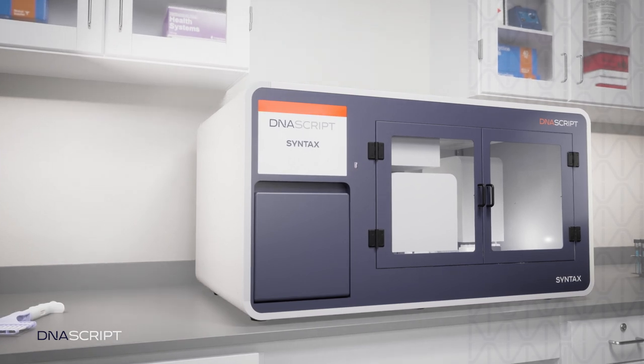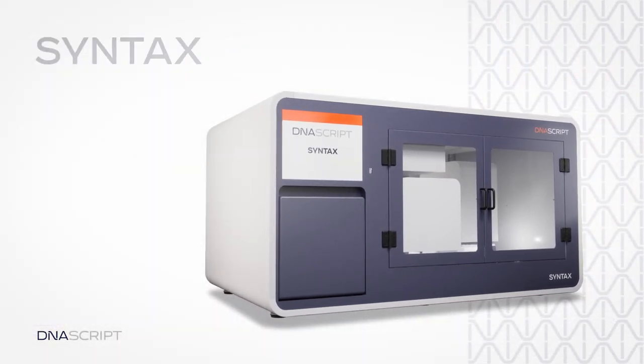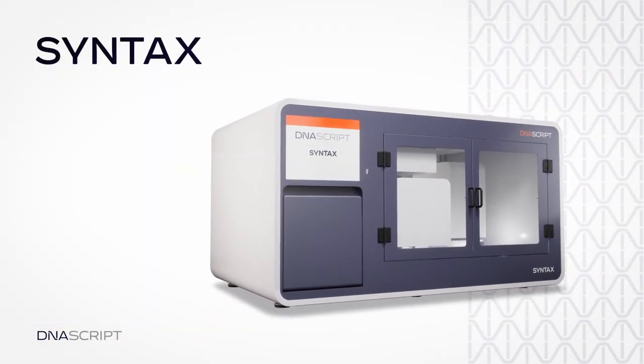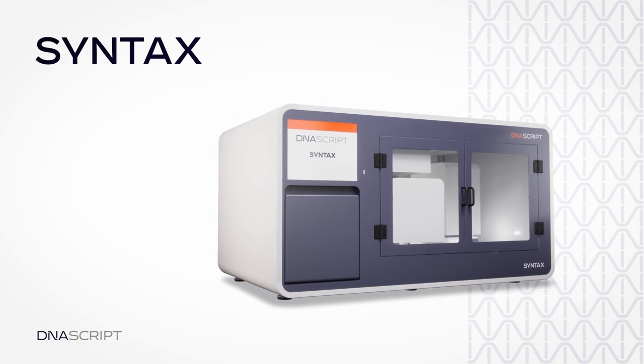By providing DNA on-demand, DNAScript's Syntax system will accelerate your innovation and power the bio-revolution.